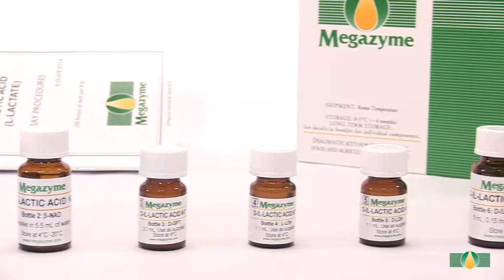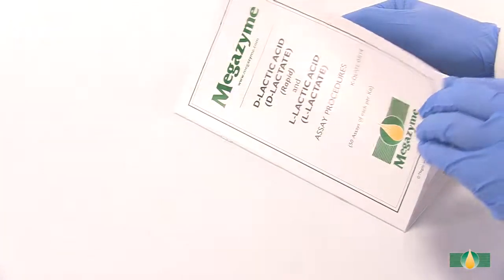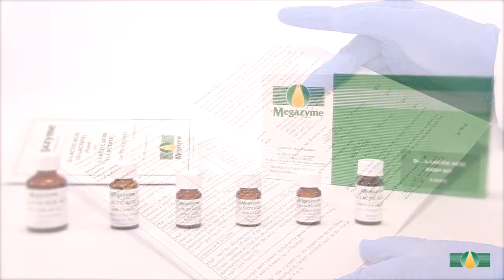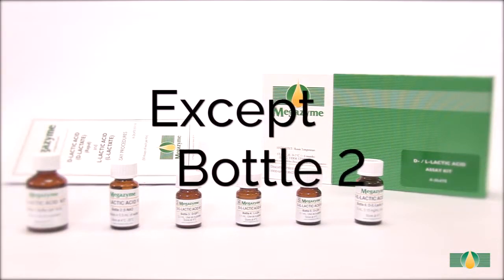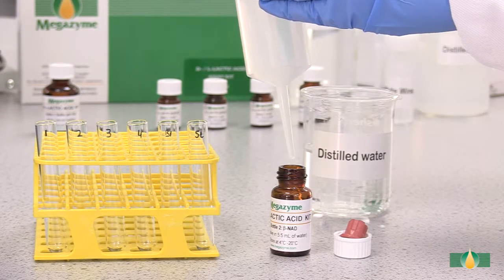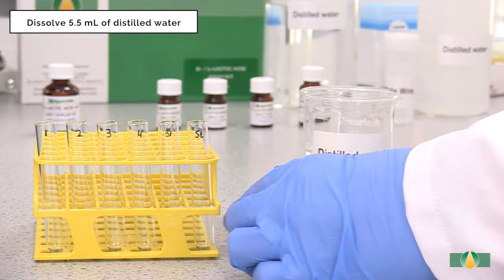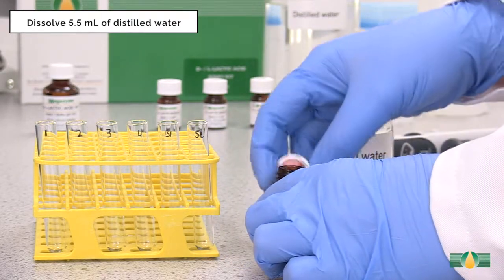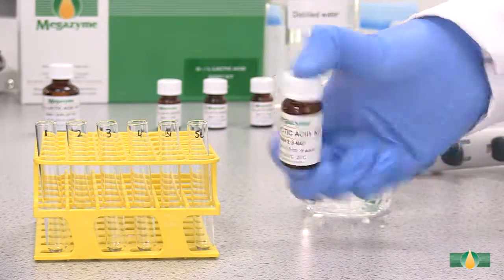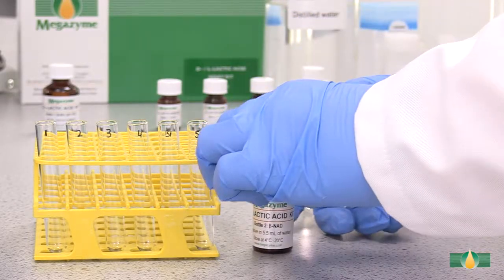Prior to sample analysis, the kit components should be prepared as described in the kit data booklet, and once prepared, they are ready for use in the manual assay procedure. All of the kit components except bottle 2 are used as supplied. The contents of bottle 2 are dissolved in 5.5 millilitres of distilled water. The bottle is capped and the contents are mixed thoroughly to ensure complete dissolution. For longer term stability, do not dissolve the contents of the second bottle until required.